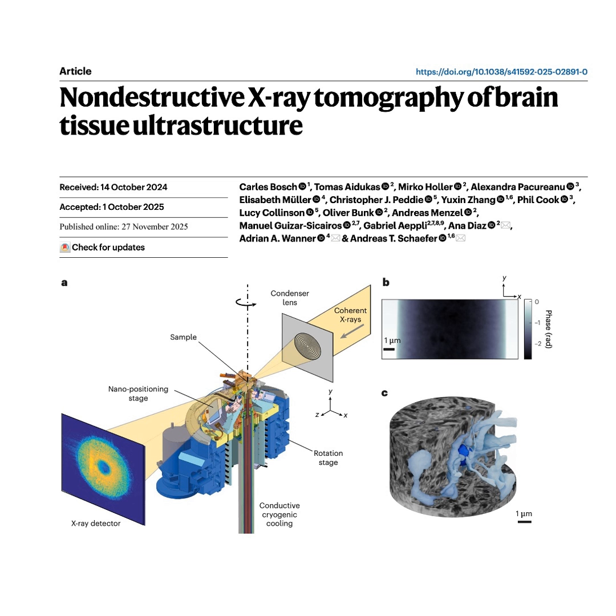So what was the practical payoff of cleaning up this warp? It was immediate, and it was substantial. For one of their samples, the nonrigid reconstruction improved the resolution from 70 nanometers all the way up to 49.7 nanometers. Wow. It successfully recovered those high spatial frequencies that the blurring had hidden. It got them much closer to the theoretical prediction. And when you combine all three, the TGPAP, the cryo, and this non-rigid reconstruction, what was the ultimate record-breaking resolution they hit? They reached an impressive 38 nanometers isotropic 3D resolution. 38 nanometers. That is genuinely ultrastructural detail.